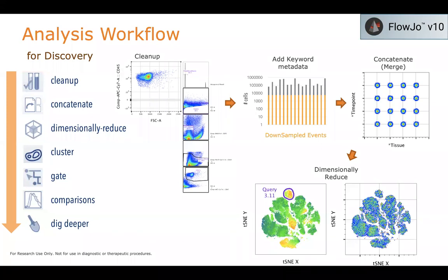But you may have other experimental variables that are present that you may not want to test up front, but are present, and it would be a good idea to carry those along. So for example, you might be working with, I don't know, 2 different cohorts of mice, right? And you have both male and female mice. Now, normally, let's say, you expect that the biological outcome for males and females is going to be the same. But regardless, you do have males and females. And so you might want to incorporate the fact that you have male and female mice into your categorical variables, even though you don't expect it necessarily to be something that would pop out, or that is something that you're immediately testing.